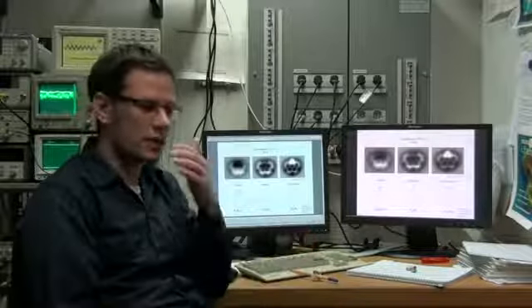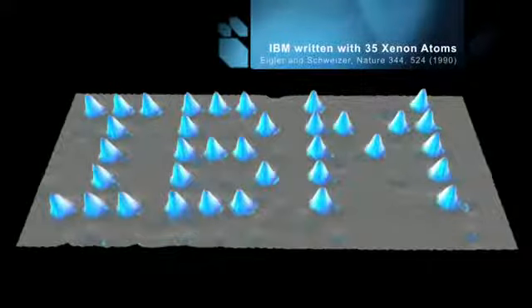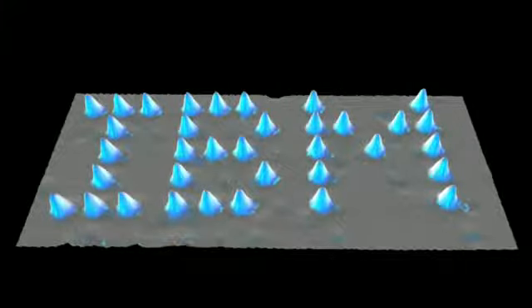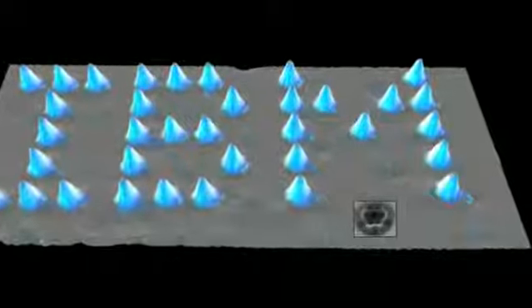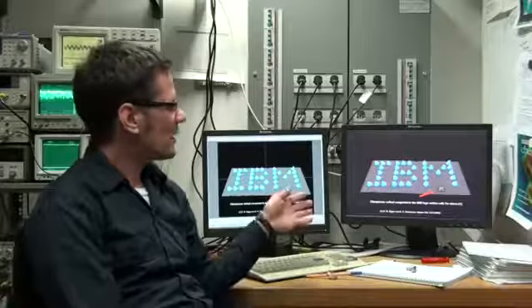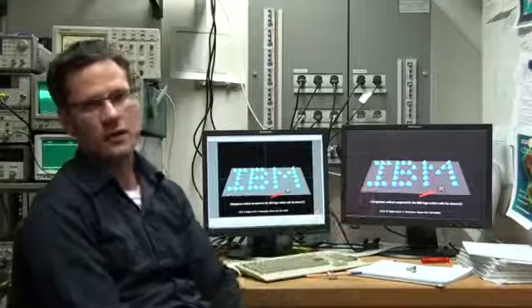And just an example, 22 years ago, Eigler and Schweitzer did this famous IBM logo pushing single atoms, and this is of course an amazing achievement, and it's still one of the smallest things we can do. It's writing with single atoms. If you compare this with now the molecule that was made, it's really another step forward. It's really tiny compared to the single atom manipulation. And you will not see another shrinking. You will not see an image of a molecule and then something that's made that's even 10 times smaller.